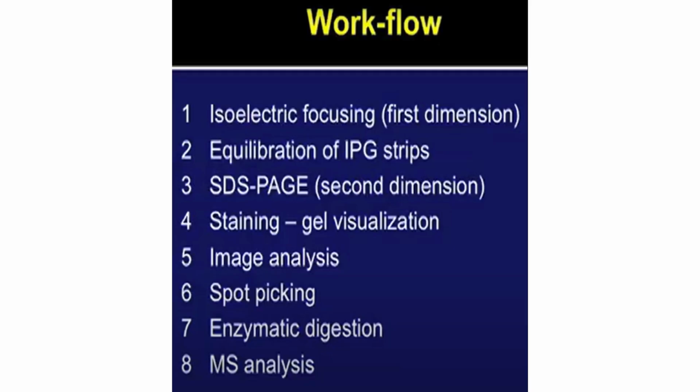So we did one dimension of SDS-PAGE wherein we use a stacking gel and a resolving gel, but in two-dimensional gel electrophoresis there's no need for a stacking gel because stacking is done with isoelectric focusing, and you can directly do the resolving part in SDS-PAGE in the second dimension while doing this technique.